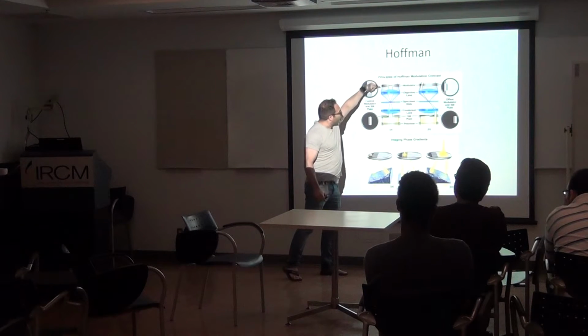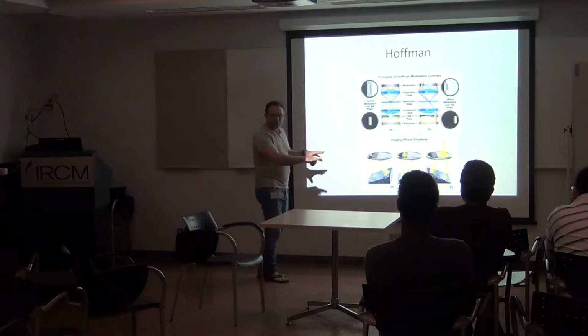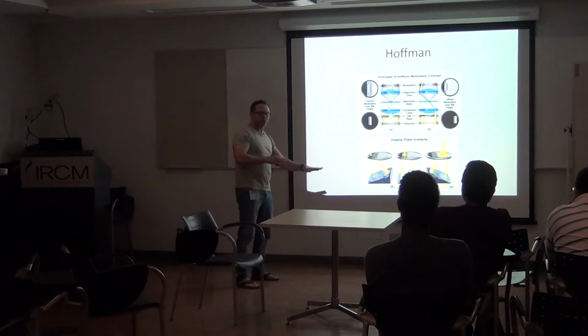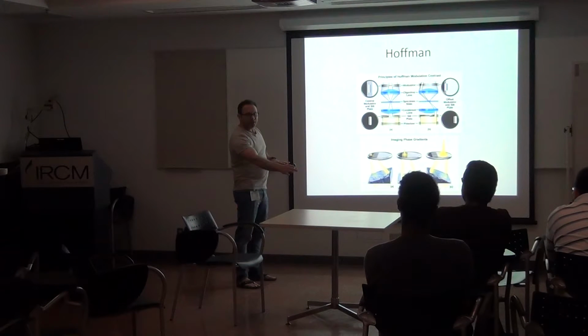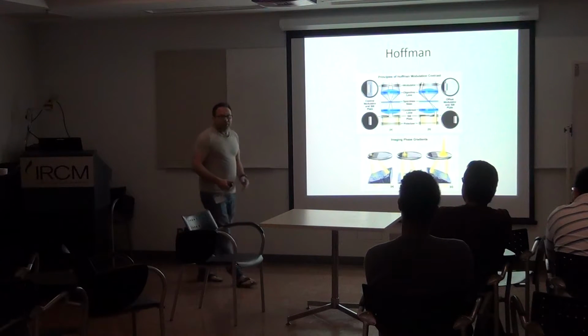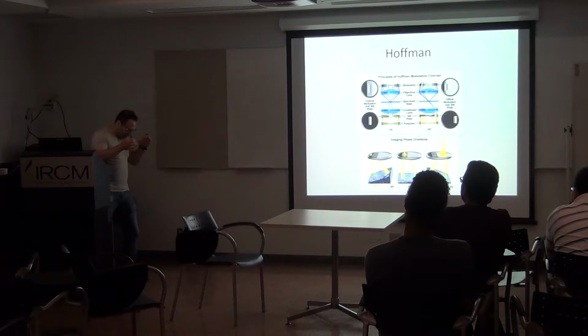And so when you bring your light source from the side, you're going to see some shadows that are created from the relief of your specimen, and you're going to see shadows on one side, and the other side is going to be really bright. And it's the same thing that you use. And yeah, that's it. So it looks really like if you have a big height and you look from really high when you look into a microscope.